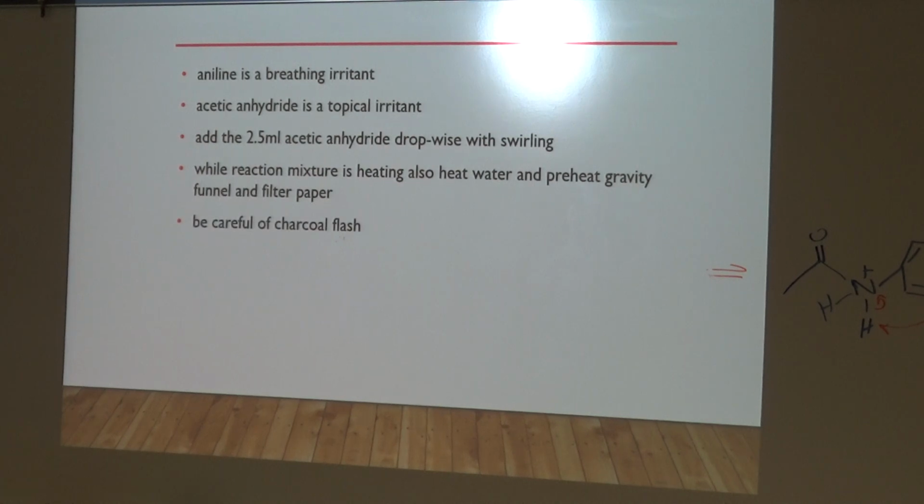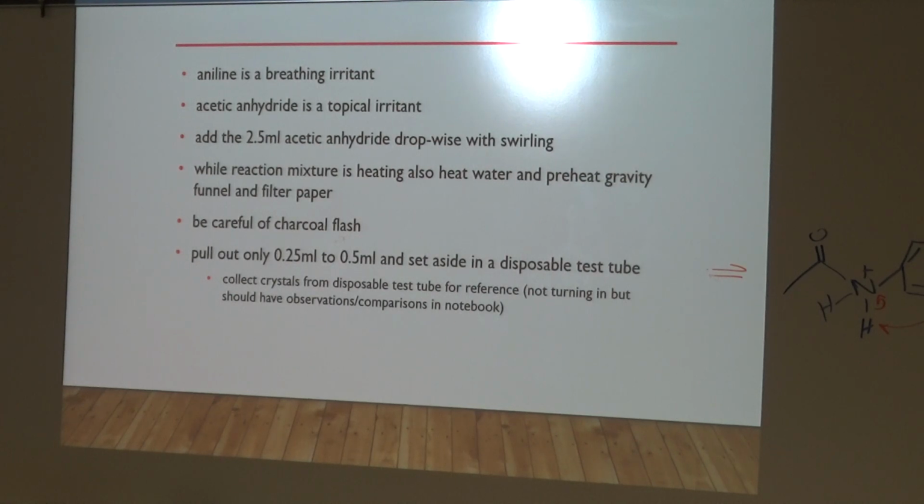Now, since we're using water as our solvent, the idea of the charcoal flashing or suddenly combusting is not too bad, but you would always want to not be staring directly into your flask as you added the charcoal. We're not going to pull out any of it. I'm actually going to do two reactions side by side, one that has charcoal and one that doesn't, and we'll compare the crystals at the end of it. We're going to dry it, and eventually I'll get you a mass, and you're going to work it up as if that was what you did.